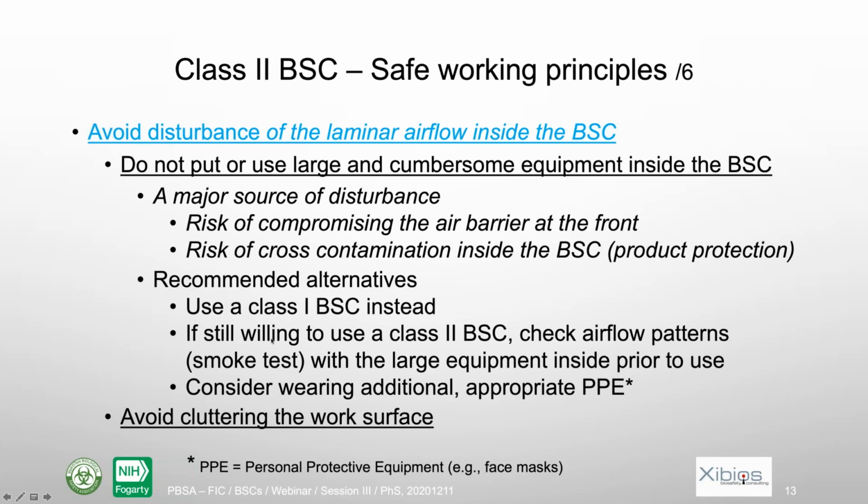If you're still willing to use a class 2 biosafety cabinet because, for instance, you don't have a class 1, in that case, the best thing to do is to do the recertification with the larger equipment inside. So you will see what the level of disturbance is. And you will see with a smoke test, for instance, if you disturb the air at the entrance and if you lose your protection.